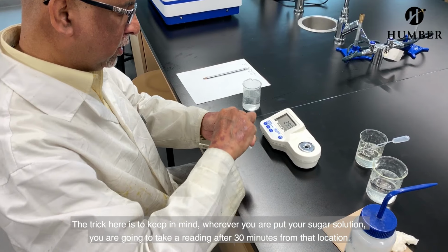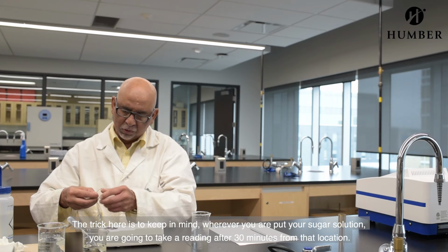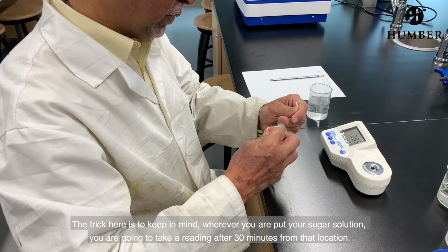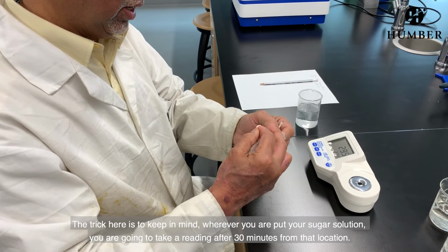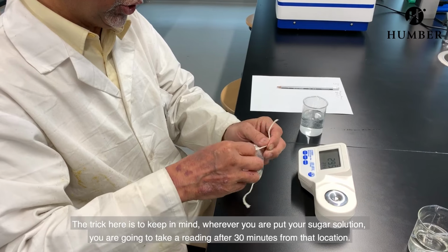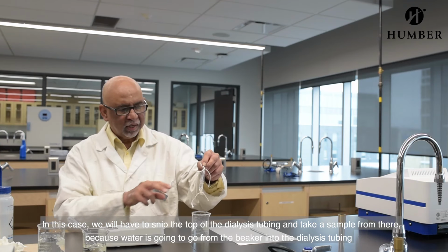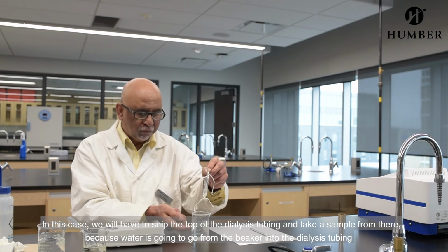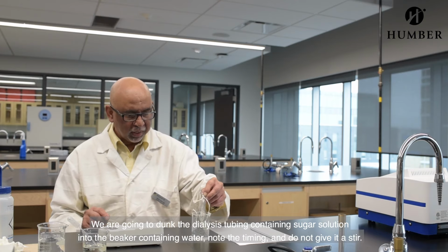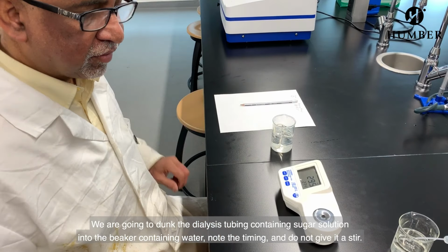The trick here is to keep in mind that wherever you are putting your sugar solution, after 30 minutes, you're going to take the reading from that particular location. In this particular case, we will have to snip this after 30 minutes and take the reading, because water is going to go from here into there. So that's what's going to happen. And we're going to dunk it in. You take your timing and you don't give it a stir after that.